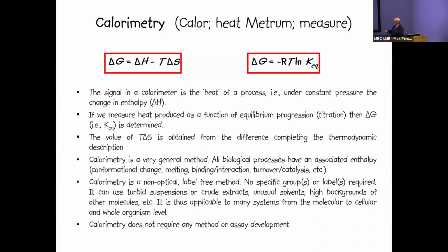And for this reason, because there is no requirement for specific groups and the universal signal is associated with all processes, this means that we don't really need any method or assay development. So potentially it's a very rapid method that you might use in your pipeline.